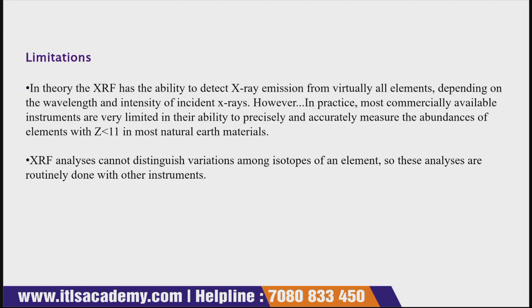Now we come to the limitations. In theory, XRF has the ability to detect X-ray emission from virtually all elements, depending upon the wavelength and intensity of the incident X-ray. However, in practice, most commercially available instruments are very limited in their ability to precisely and accurately measure the abundance of elements. So this is one of the major limitations or disadvantages of X-ray spectroscopy.